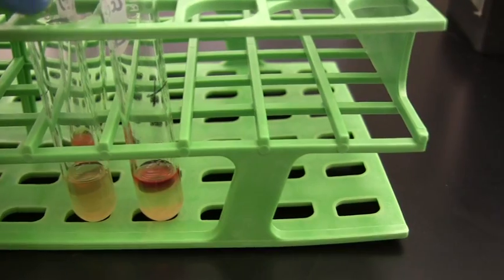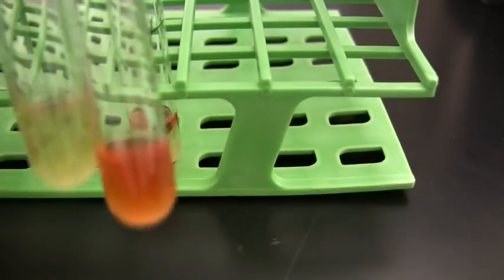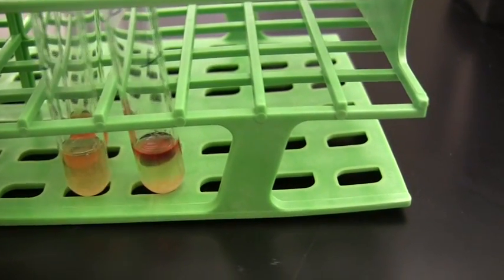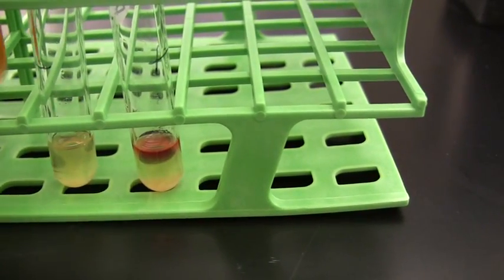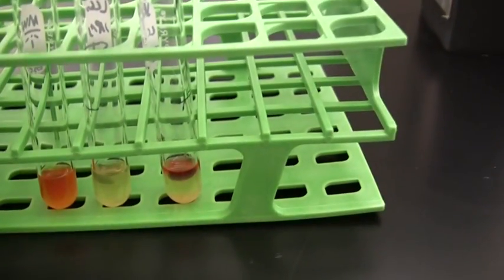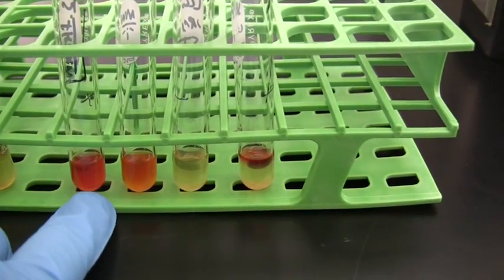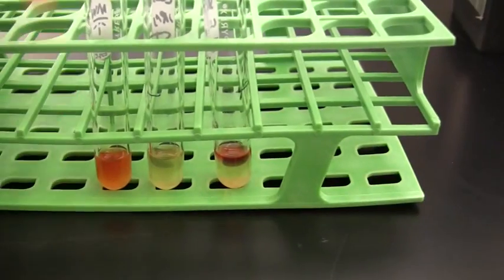And I compared a couple different methyl red negatives here, just to note on these methyl reds that it clearly needs to be a bright red color. So I'm going to move this other one over here, pull this out. This is actually a negative methyl red. It's more of an orangey color. It needs to be bright red to be considered positive. Over here you can see clearly, this is from the test I started with, a clear bright red color, which is going to indicate an acidic end product.